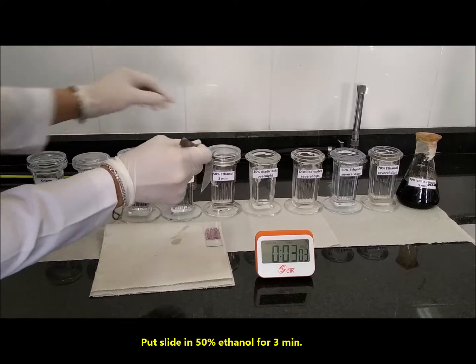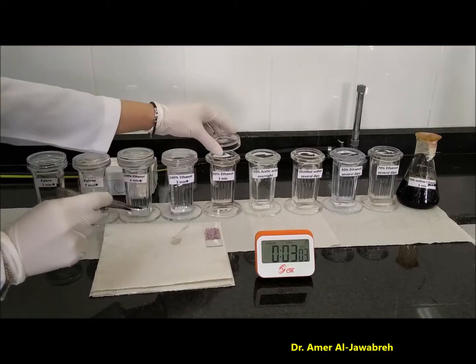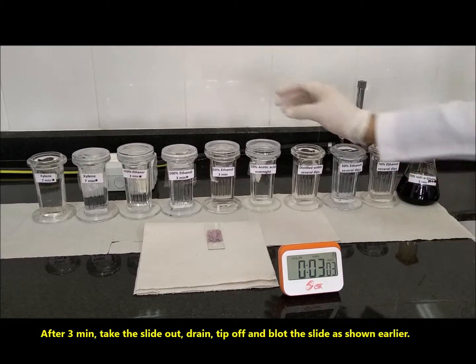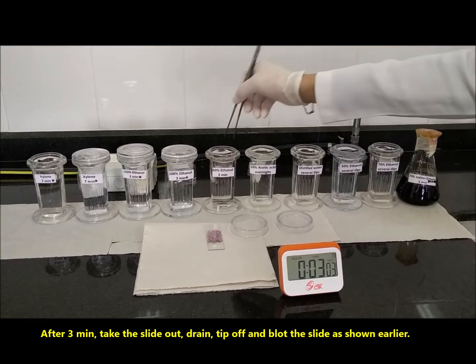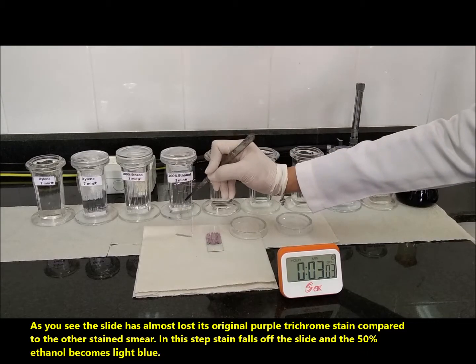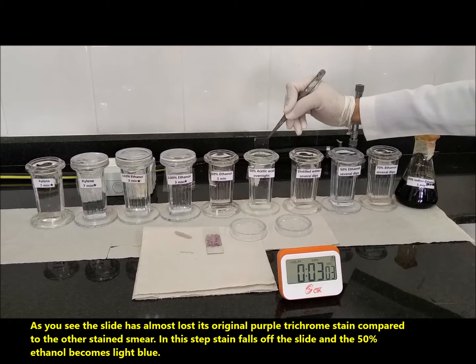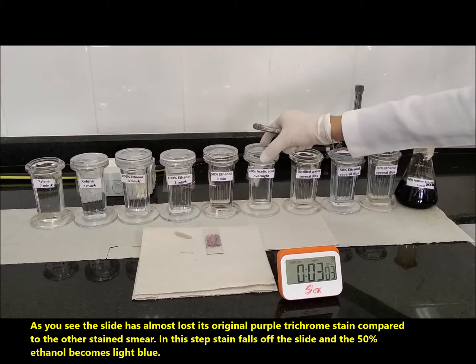Put the slide in 50% ethanol for 3 minutes. After 3 minutes, take the slide out, drain, tip off, and blot the slide as shown earlier. As you see, the slide has almost lost its original purple trichrome stain compared to the other stained smear. In this step, stain falls off the slide and the 50% ethanol becomes light blue.